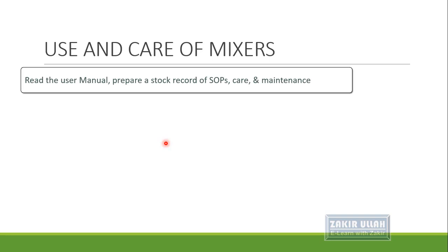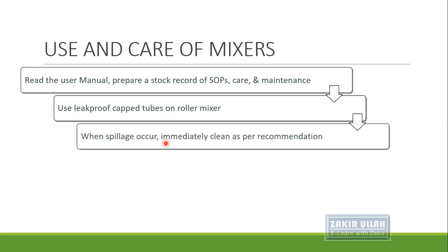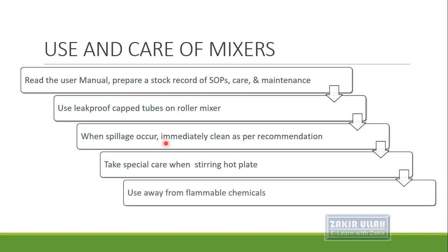For every instrument, read the user manual for its operation and prepare a stock record containing all the SOPs, care, maintenance, and any problems encountered. When using a roller mixer, use capped tubes with leak-proof caps so contents do not leak out. If spillage occurs, immediately clean all the area and the mixer as recommended by the manufacturer. When using a magnetic hot plate stirrer, take special care as the plate is hot and may cause heat injury. Use these mixers away from any flammable chemicals.